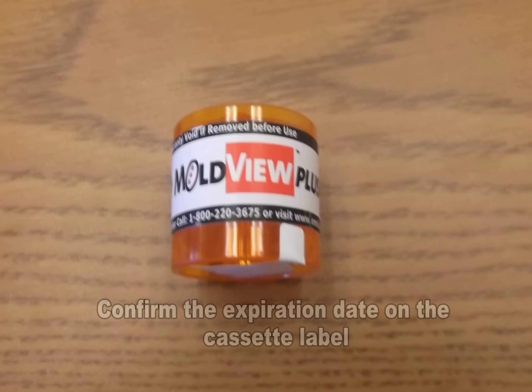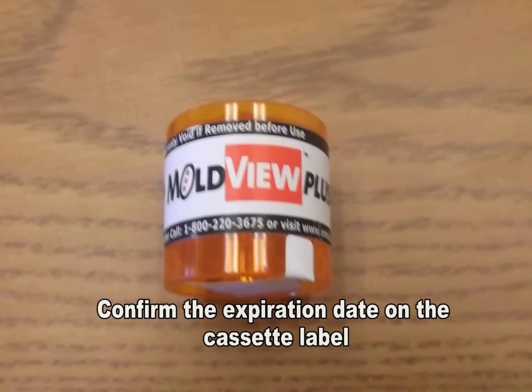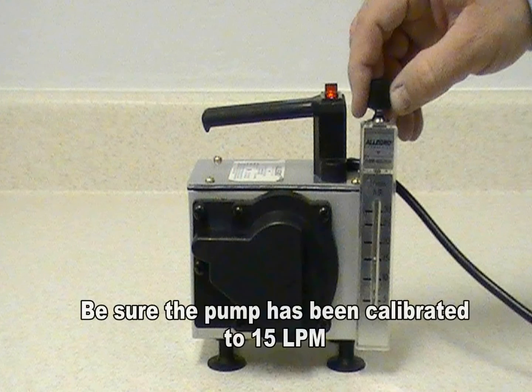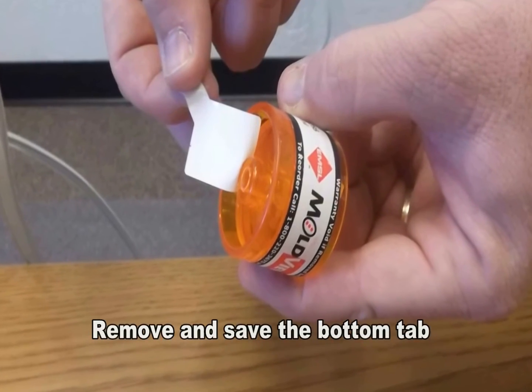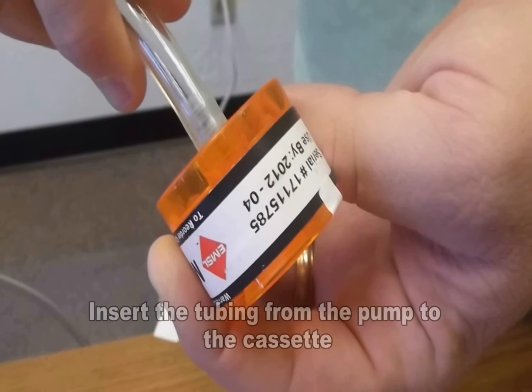To use the MoldView Plus, first confirm the cassette's expiration date. Make sure the pump has been calibrated to 15 liters per minute. Then remove the bottom tab and keep for later use. Insert the tubing from the pump to the cassette.